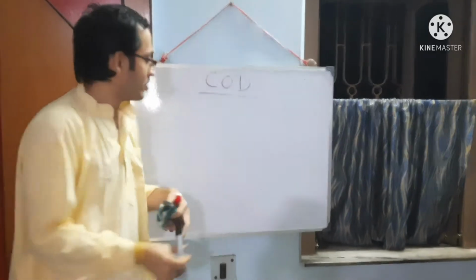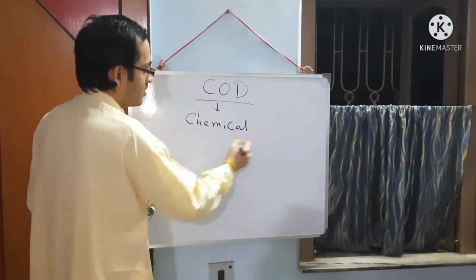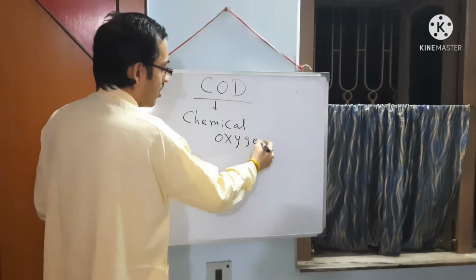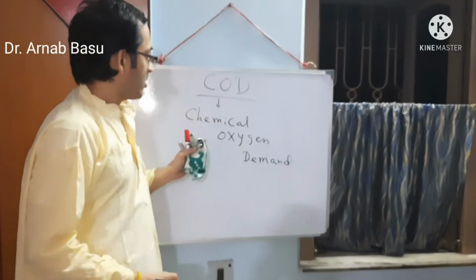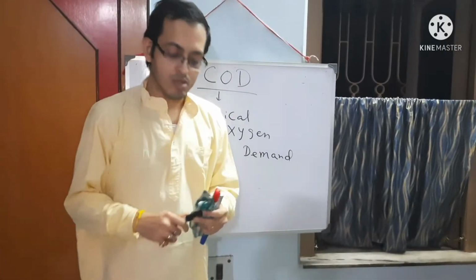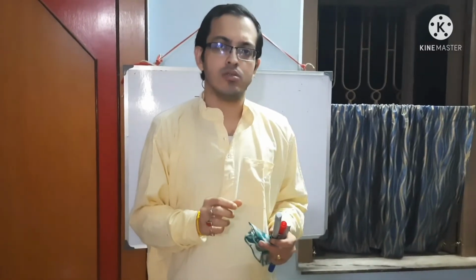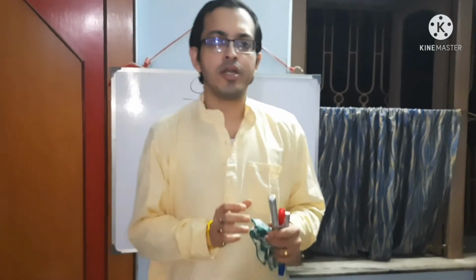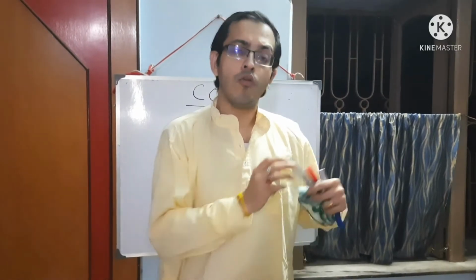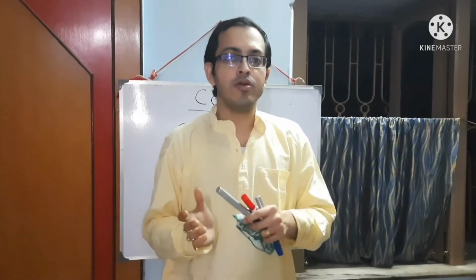COD means chemical oxygen demand. It is the amount of oxygen required for oxidation of organic materials, all the organic materials, whether biodegradable or not biodegradable, of any water bodies.